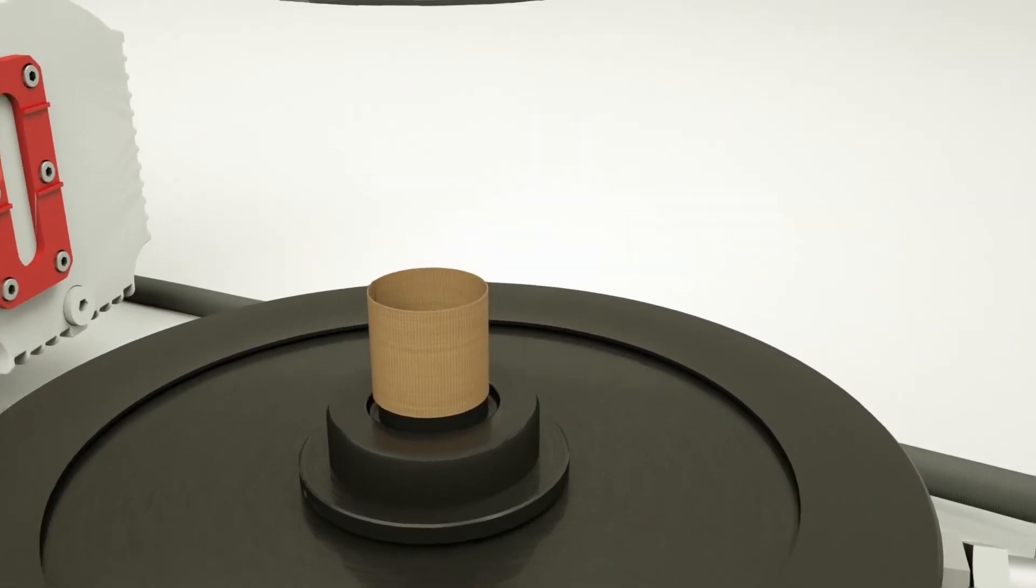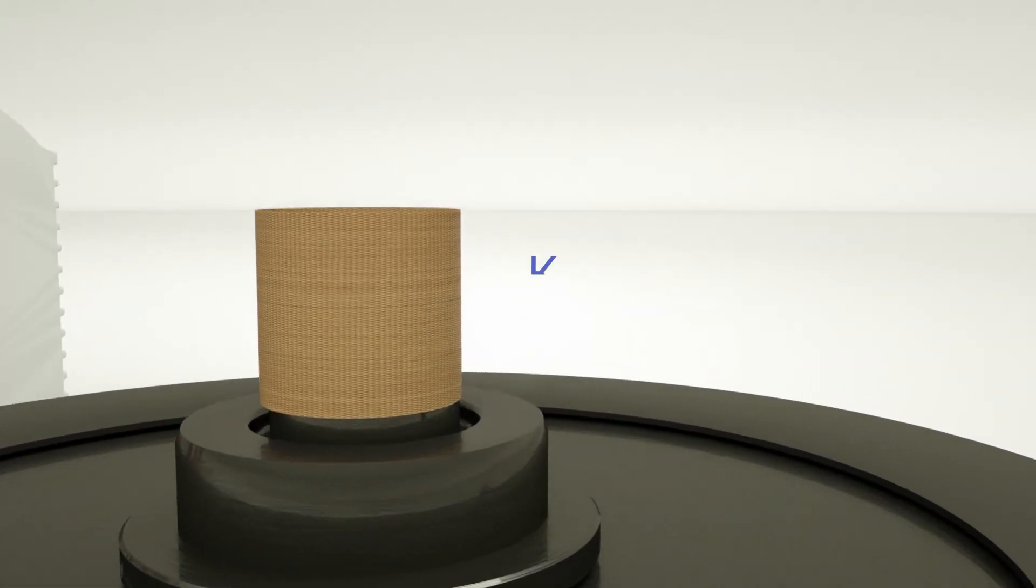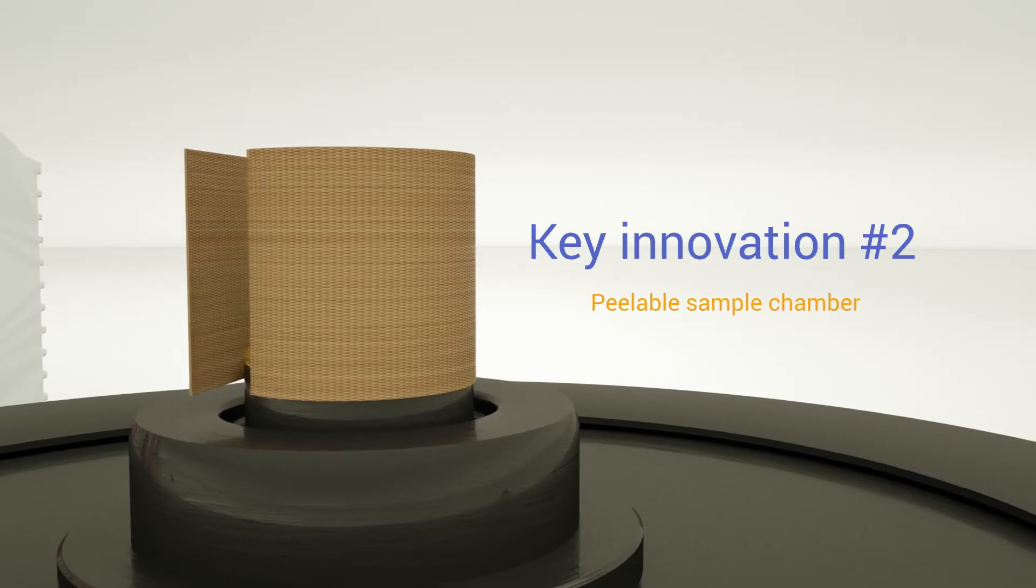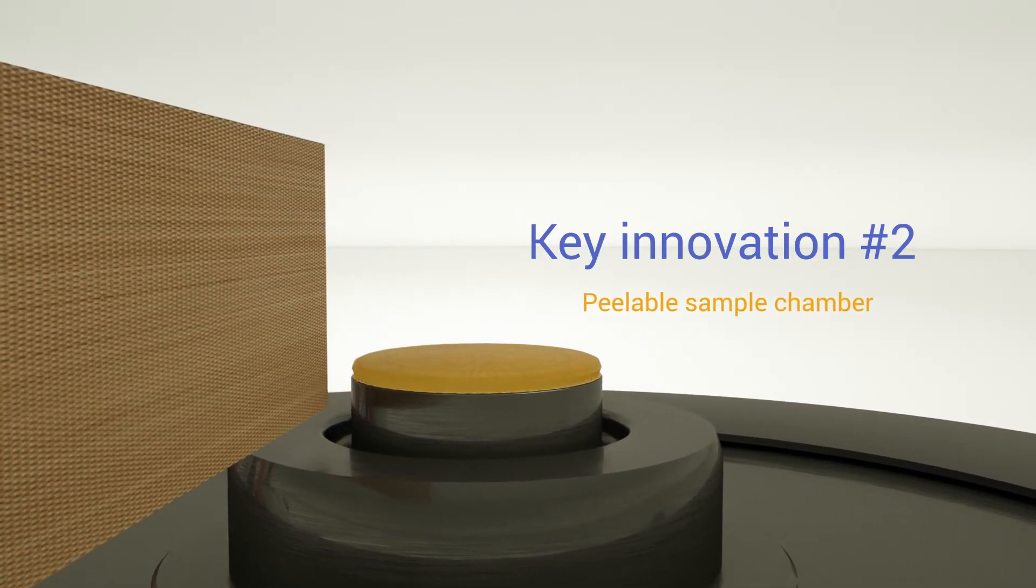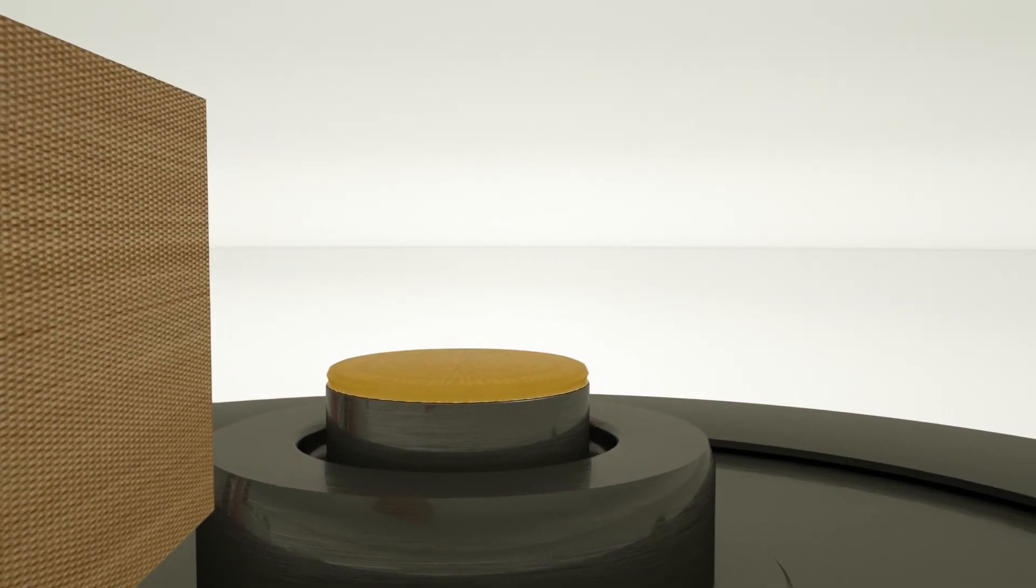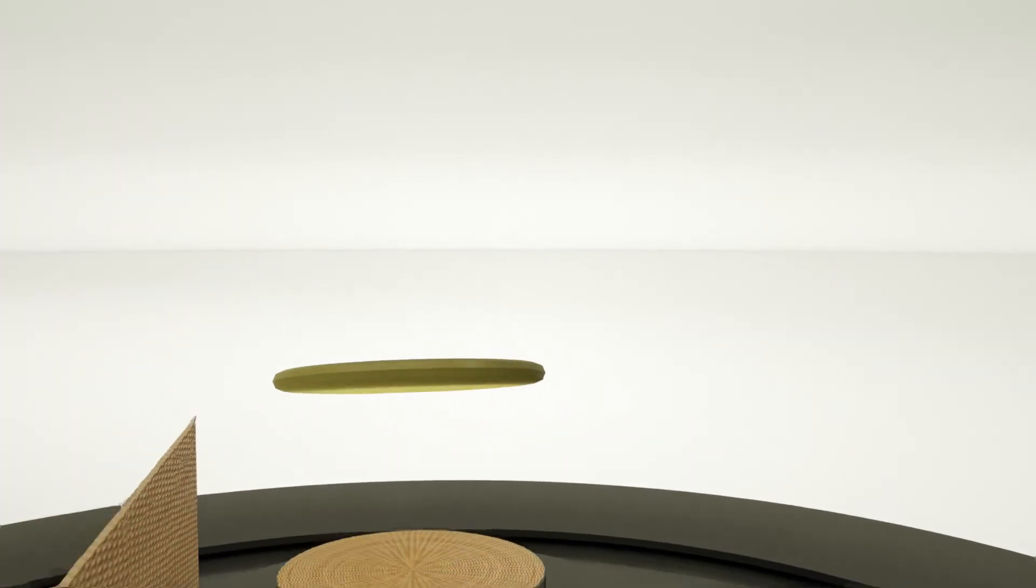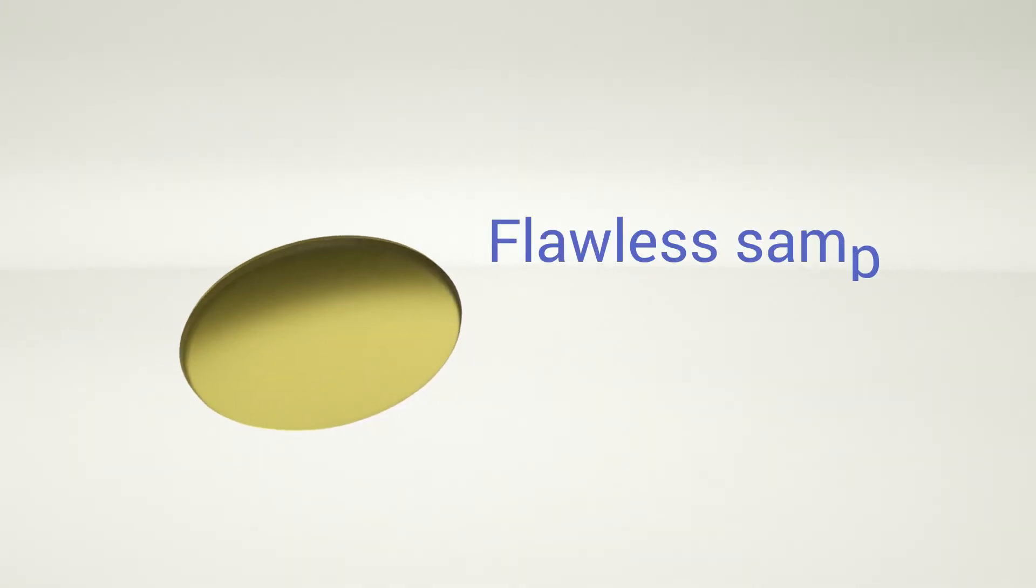A few minutes later, the sample can be released with ease thanks to our second key innovation: a peelable sample chamber formed by Teflon separation foils. The peelable foils can be replaced immediately, saving material and time otherwise spent on tedious cleaning.